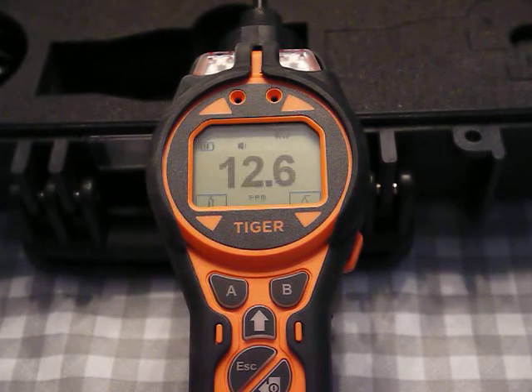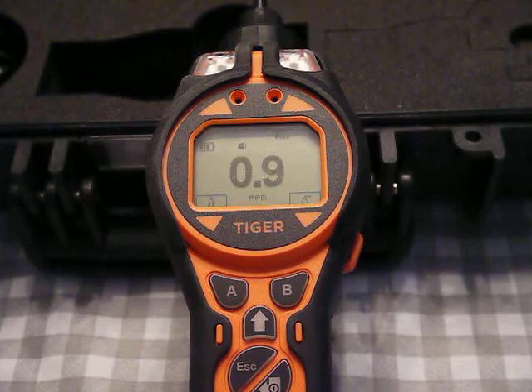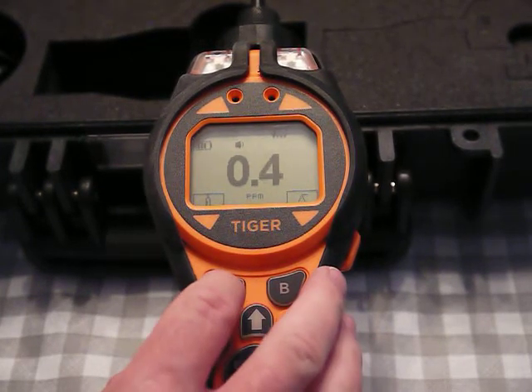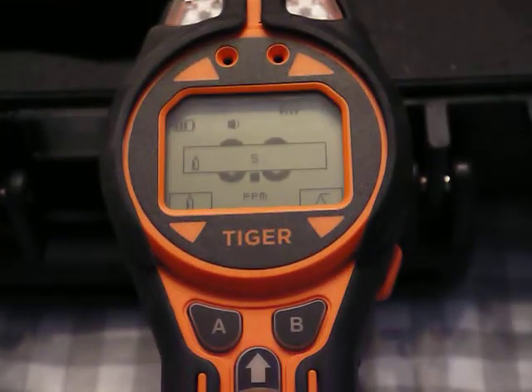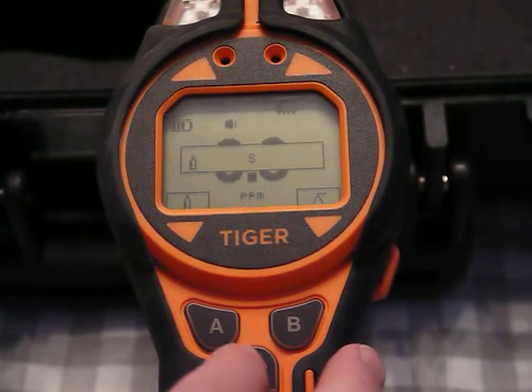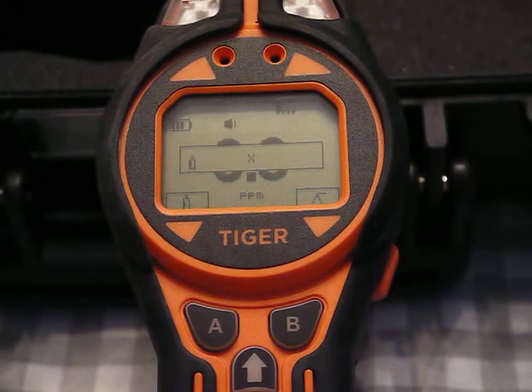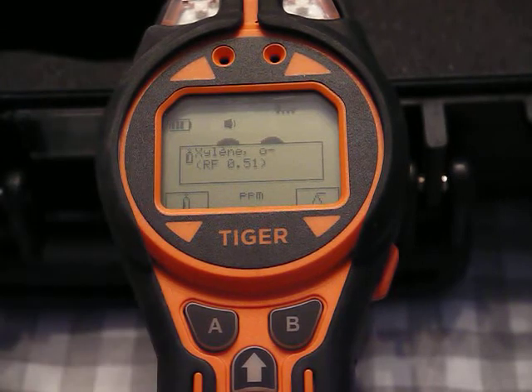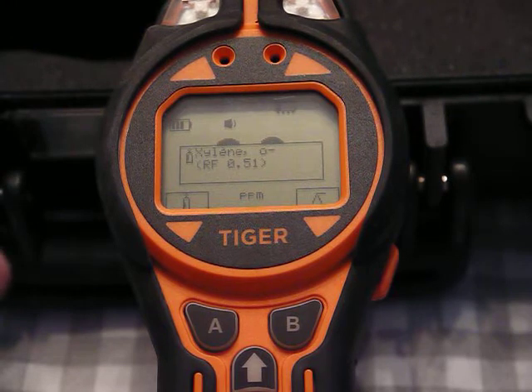If I didn't want to measure styrene and wanted to measure something else, I would go back into that cylinder of gas — I'm just going to try to zoom in here a bit — and I'm looking for xylene, which is under X. I would go through and choose xylene.